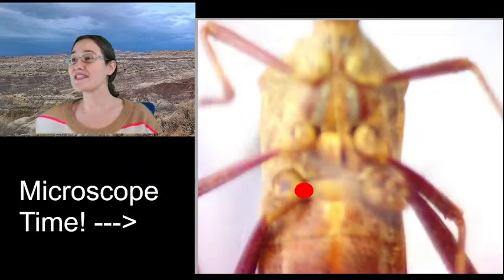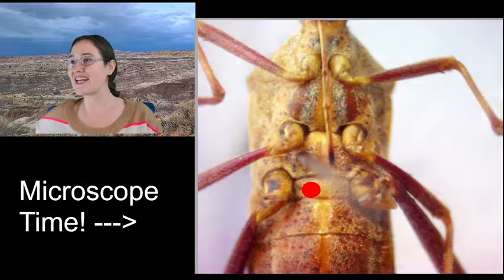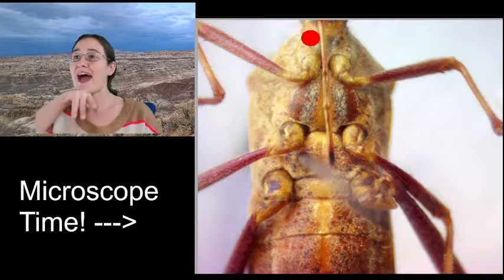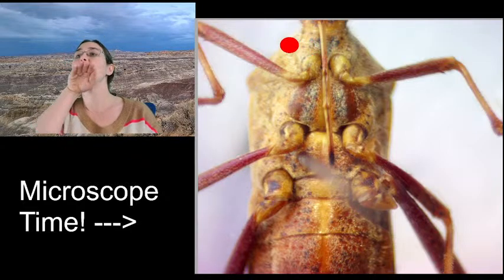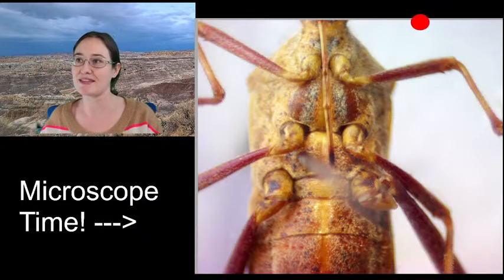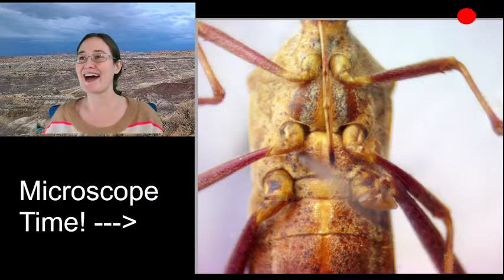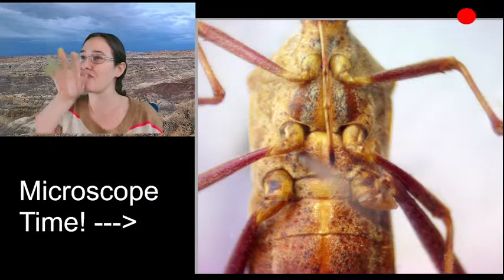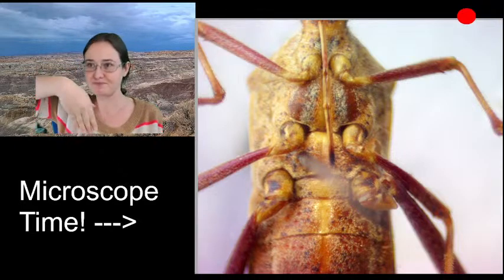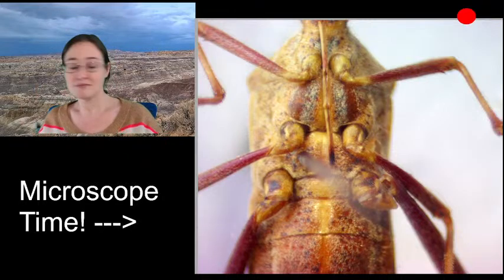So this is a very, very long straw-like mouth part that he kind of just tucks up underneath the ventral side and has the ability to kind of move it up a little bit, but he's still kind of piercing down into the plant that he's feeding on, right? This mouth part never goes whoop and just hangs out. It doesn't really go forward, but it does have a little bit of movement so that it can pierce into a plant.